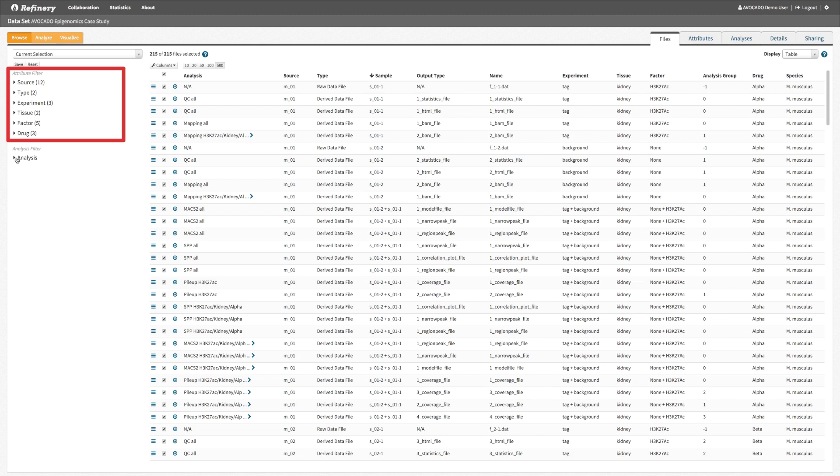Epigenetic factor, or drug used for treatments. These attributes can be used for faceted browsing.